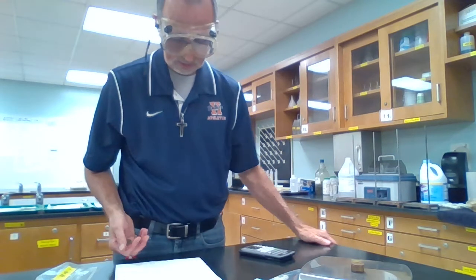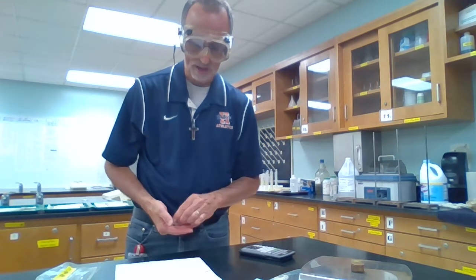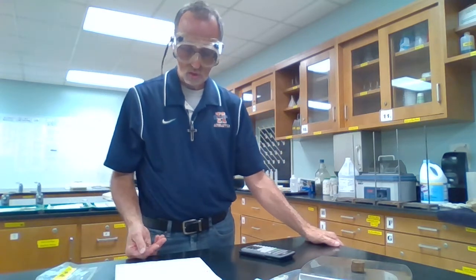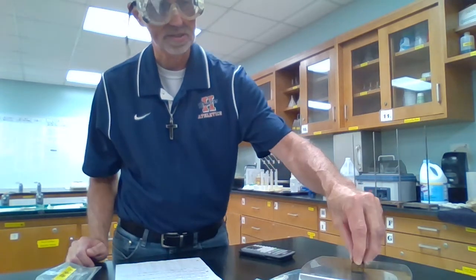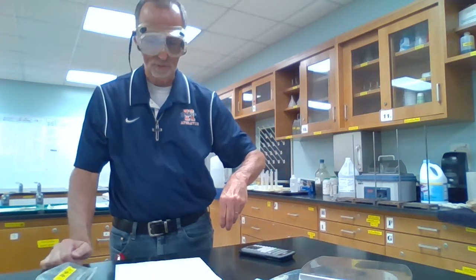And then 2 more gets us to 7. 7 pennies, 21.51 grams. 21.51. 2 more gets us to 9. 27.63 grams. 27.63, and then 4 more, which gets us to 13, is 39.94 grams. 39.94. So there are the masses of our pennies for set A pre-82.